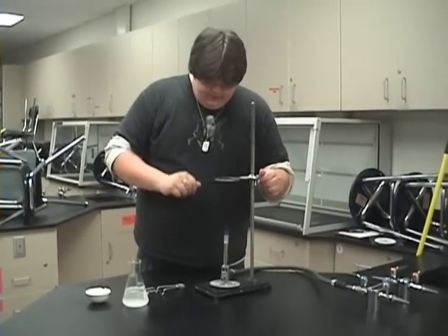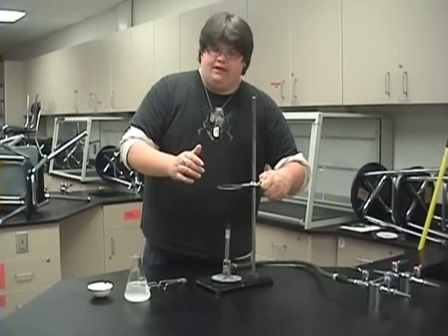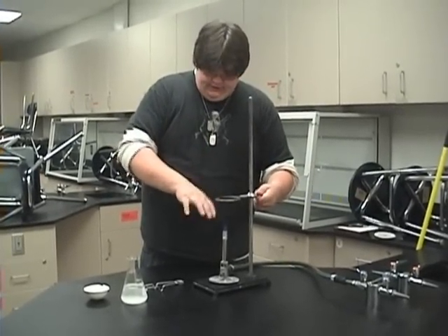You take this and bring it down so it is on the tip of the flame — not any part of the flame, the tip of the flame. Not the inner blue flame.